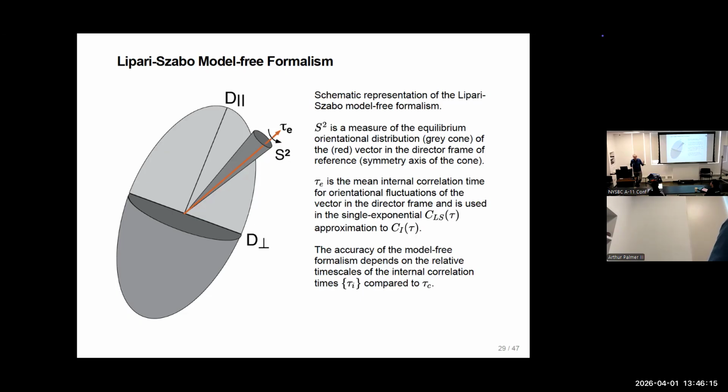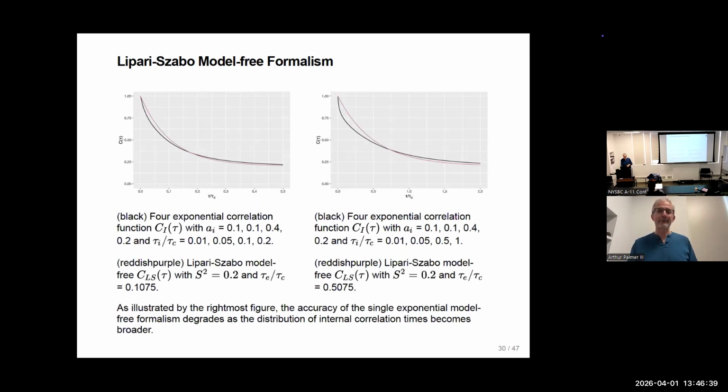Of course, that's perhaps not so helpful if you're really interested in the underlying mechanism. But these days, if we want mechanism, we mostly look at MD simulations to get ideas about mechanism, and the NMR to get the amplitude and the time scales, and then try to test the mechanism by mutation, etc.